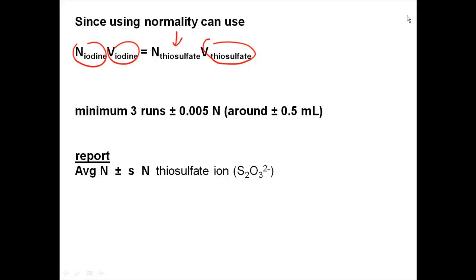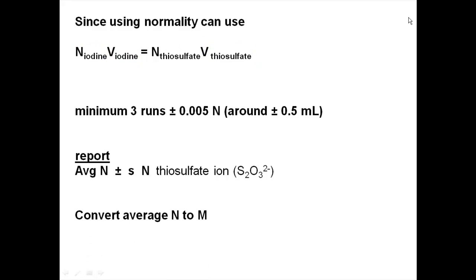One other thing I expect you to do is convert your average normality to molarity. I want you to calculate your average normality to molarity. Now, realize since we're talking about thiosulfate, which is 1 equivalent for 1 mole, it's going to be the same numeric number.